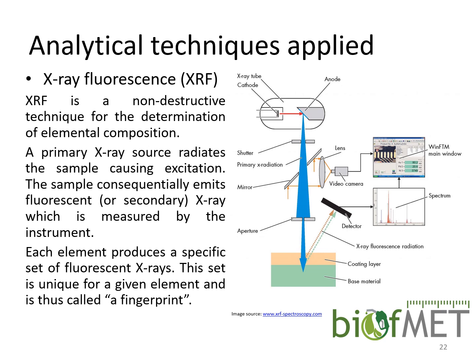Of course, you need to do some homogenization of the sample in order to get a better quality result, but the sample is tested as it is. The principle is that you have a primary source of X-rays coming from the anode, and they are used to bombard the sample, and fluorescent or secondary X-rays are coming out of the sample.